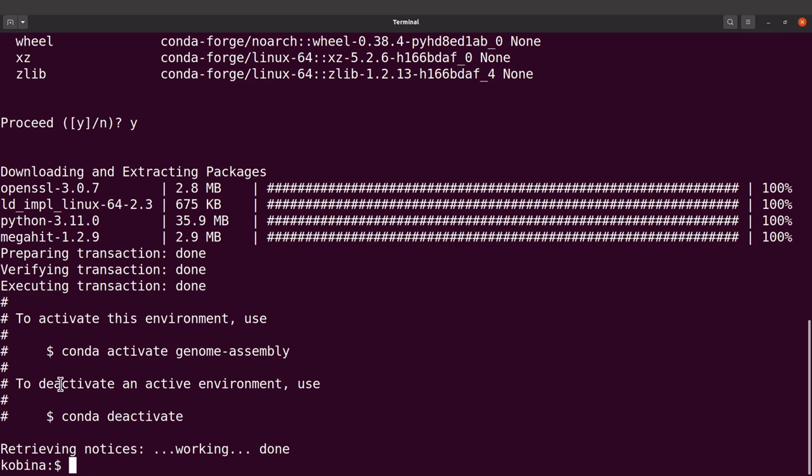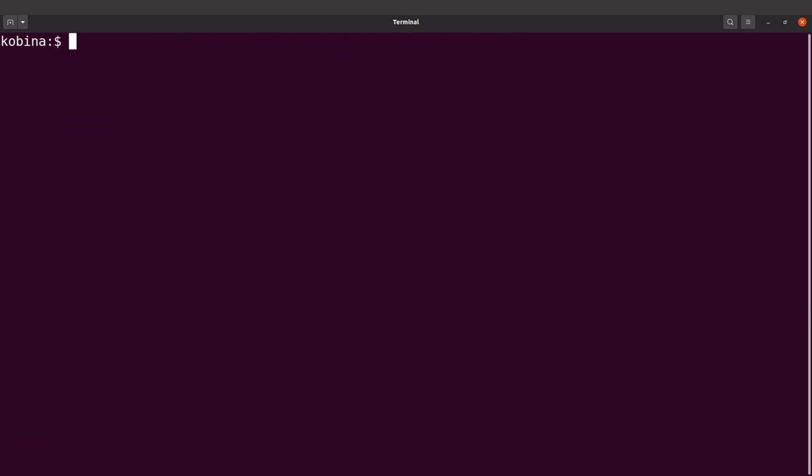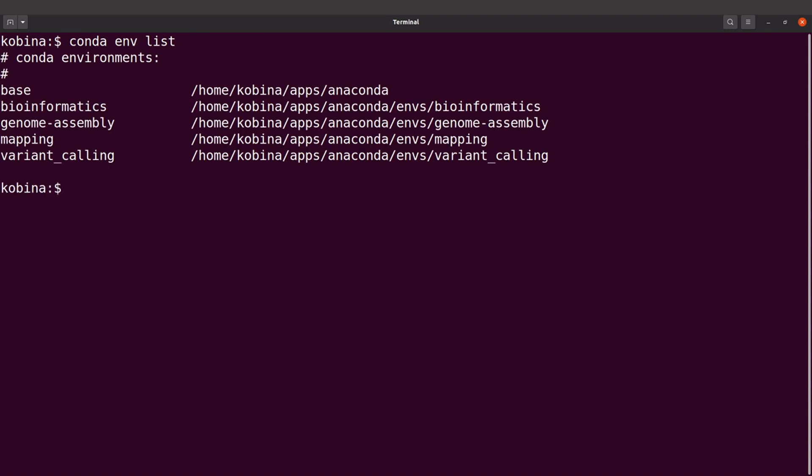Let's test MEGAHIT. First of all we need to activate the environment. If you have forgotten the name of the environment you can use conda env list. This will list the environments for you. We used genome-assembly, that was the name of the environment.